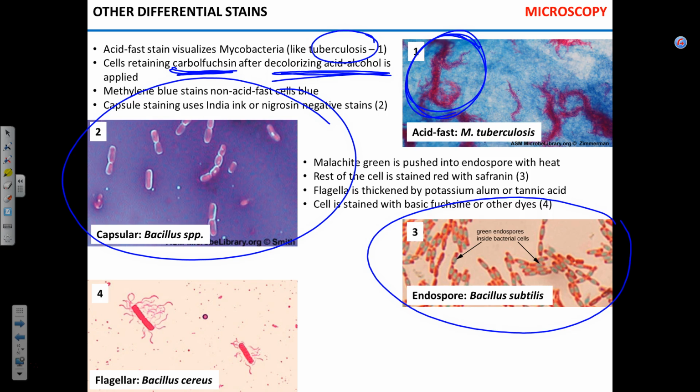And when you place this endospore on the plate, endospore being in a wet, nutrient-rich environment, it germinated and the bacteria kind of popped up, like a bird from an egg, something like that. So knowing if you have a spore former, like this Bacillus subtilis, can help you in diagnosing the disease.